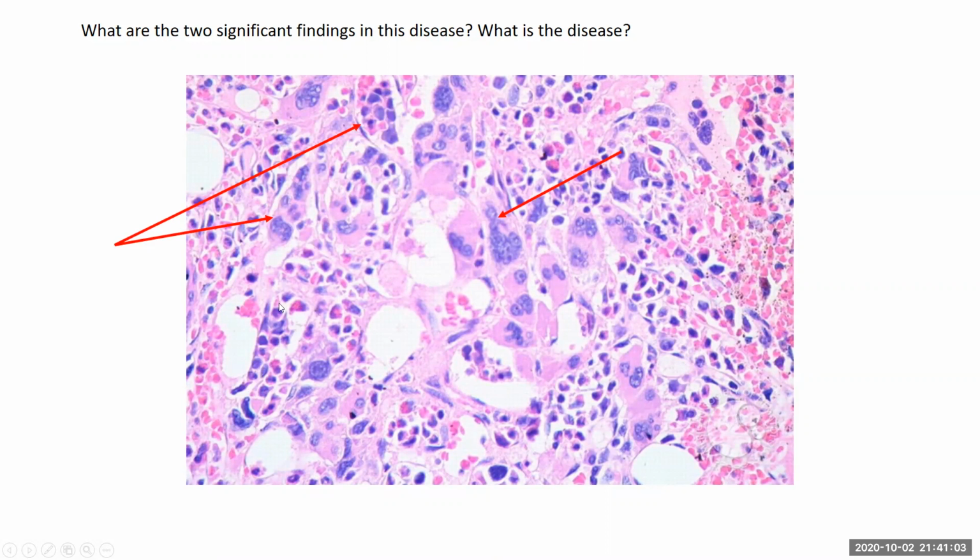They're packed with hematopoietic elements. So you have early granulocytic and erythroid precursors as well as some megakaryocytes within these sinuses. That is a classic abnormal finding in this disease because it is indicative of extramedullary hematopoiesis. Say this patient has a gigantic spleen. Given these findings, this is a myeloproliferative neoplasm, with lots of megs, atypia, and extramedullary hematopoiesis occurring in the sinuses. What disease process am I describing?